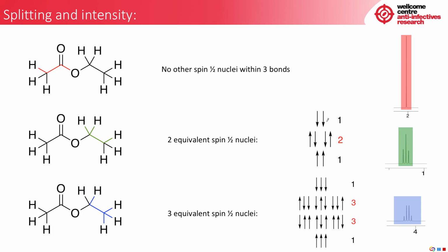But there is an intermediate level, and there are 2 ways to achieve it because these states are degenerate. Because it can be achieved in twice as many ways, this transition occurs twice as often. And so when we look at the lines, we get an intensity pattern that goes 1, 2, 1, and gives us a triplet.